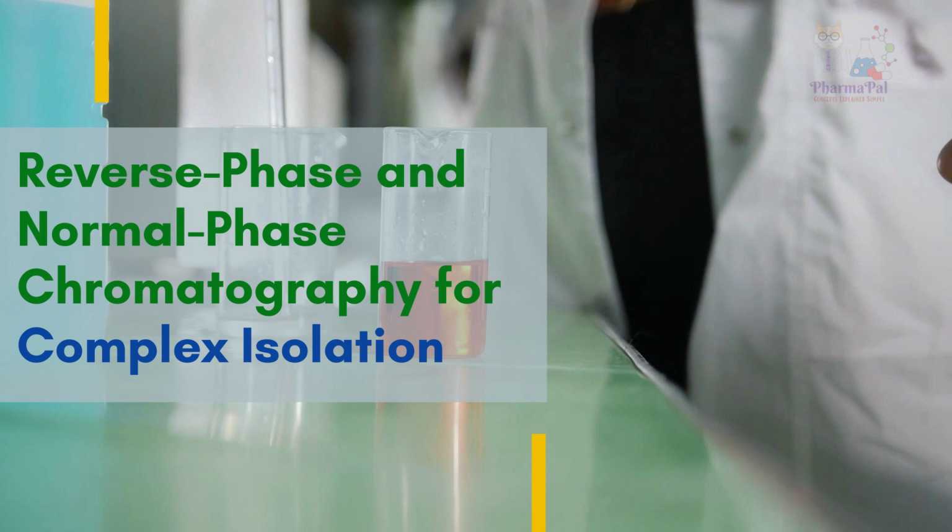Now, let's talk about chromatographic techniques to further purify these compounds. For reverse phase chromatography, we use a non-polar stationary phase and a polar mobile phase. This technique is ideal for separating polar compounds like caffeine and acetaminophen. In reverse phase chromatography, caffeine and acetaminophen will interact differently with the stationary and mobile phases based on their polarities, allowing for effective separation. For normal phase chromatography, we use a polar stationary phase and a non-polar mobile phase.